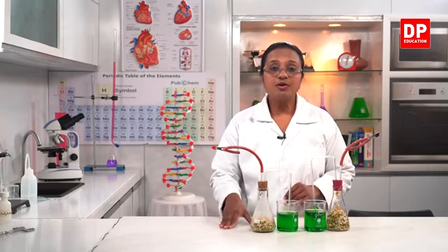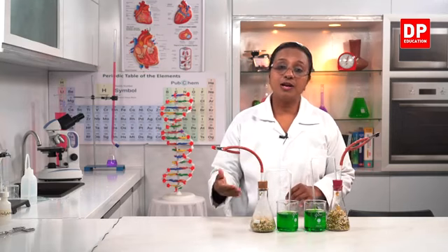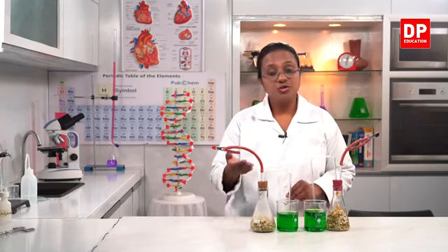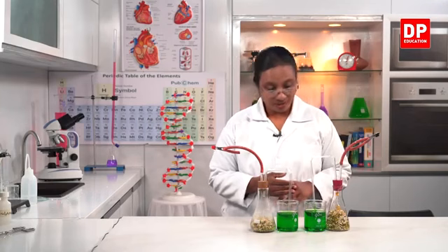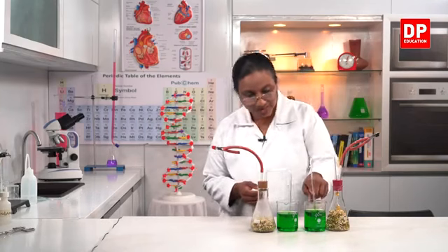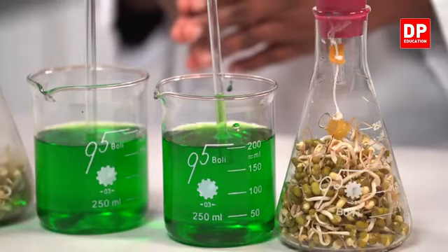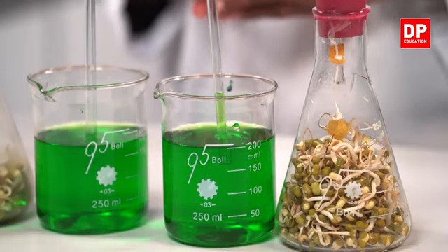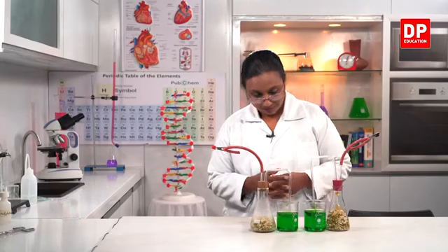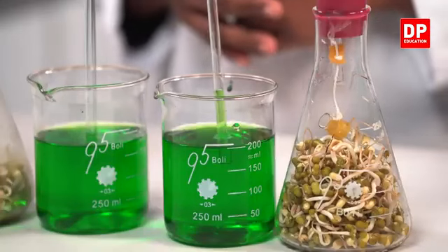The volume of oxygen that is inhaled is equal to the volume of carbon dioxide that is exhaled. So there is no space available for the colored water to rise up. So here now you can see, students, as I speak even, you can see the rising up of the colored water. So this observation is very clearly visible to you all. You can see now the colored water level has risen up to somewhere here.